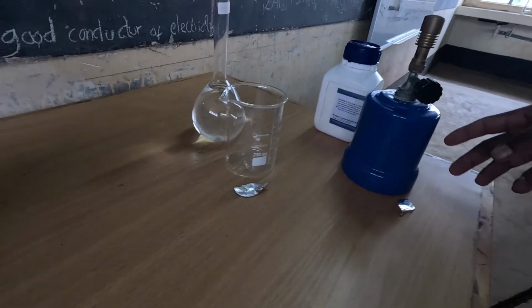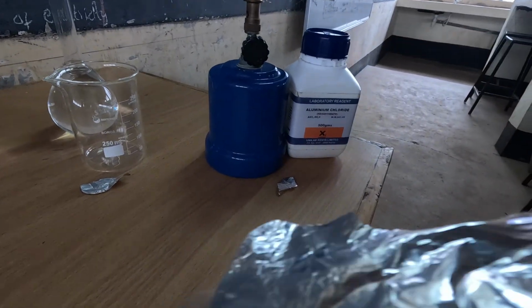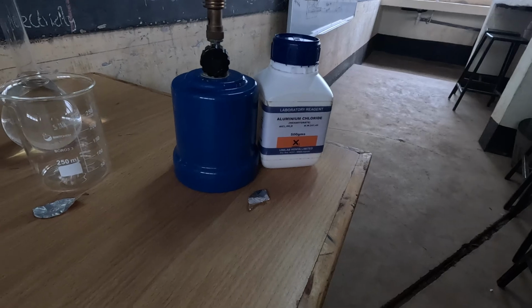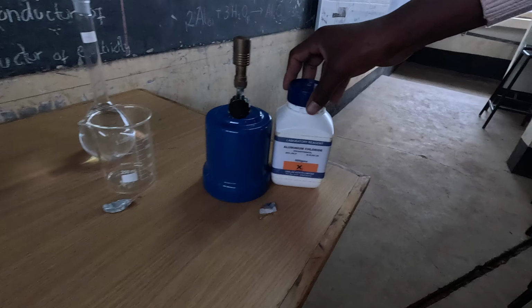I'm going to try to burn it so that we can see whether it is going to burn. And also I'm going to use aluminium chloride to prove to you that aluminium chloride can sublime, because this one is formed when aluminium reacts with chlorine.